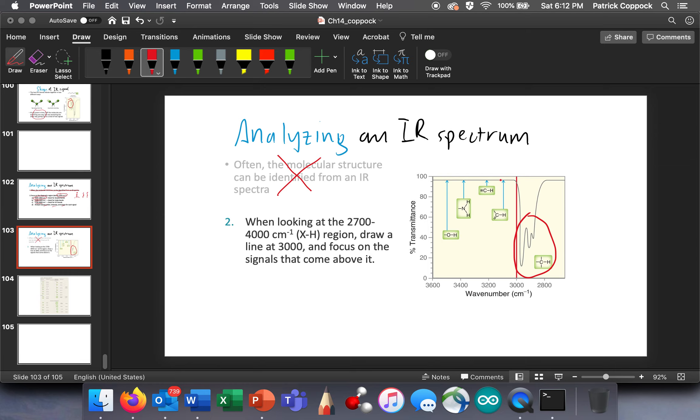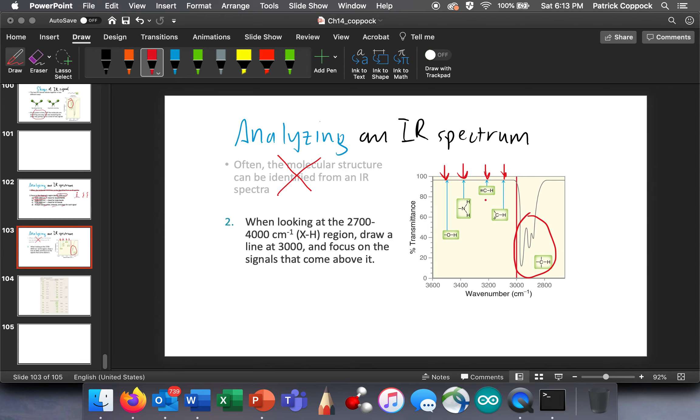We're going to get alkenyl hydrogens right there. We're going to get alkynyl hydrogens right here. We're going to get amino hydrogens here, and then we're going to get hydroxyl hydrogens up even further. Actually, we're going to see those down... that's sort of the range we're going to see those in. Of course, it's not going to be exact at those points.